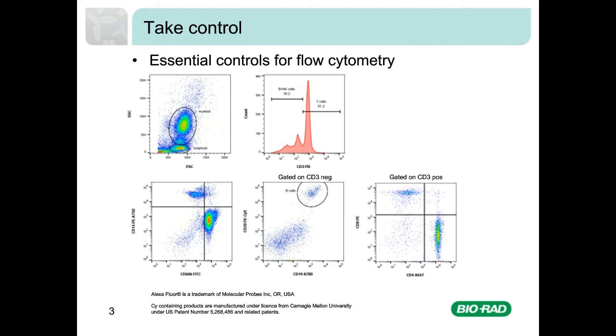colour, 7 colours as shown on this slide, where I have stained human blood for CD3, 4 and 8 to look at T cells, CD19 and 20 for B cells, and CD14 and CD66B for myeloid cells, or even for those very experienced users who are doing 17 colours.